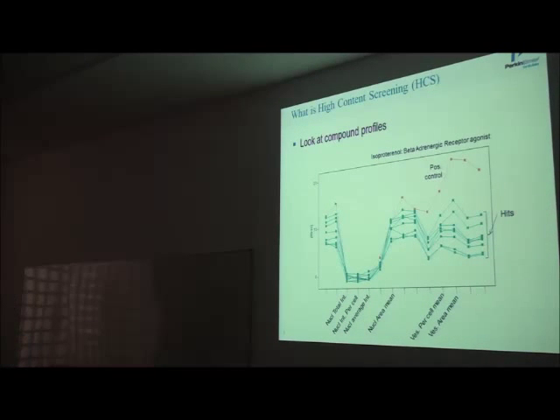When you say label-free, you mean transmitted light? No, it's stainless. I would call it stainless. Stainless but fluorescent? Autofluorescent? No, it's bright field. It's white light, not fluorescent, just white light.